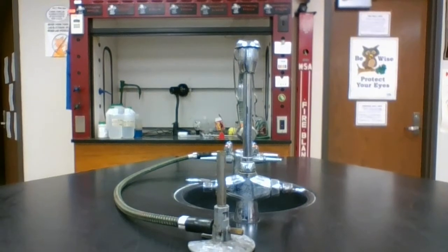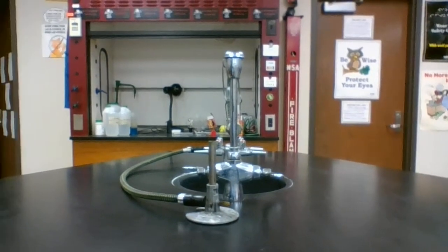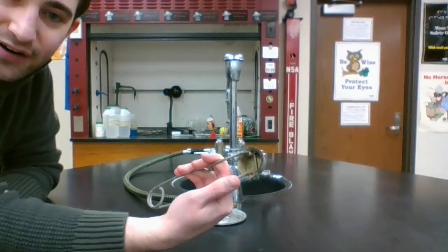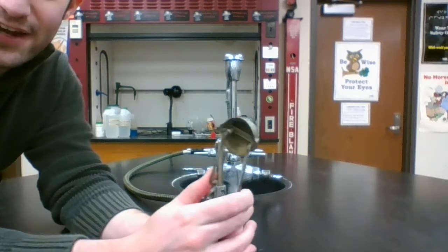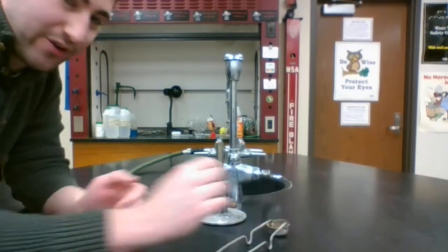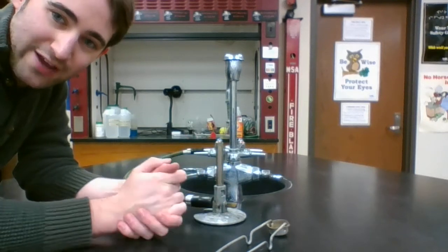Okay, so this is a Bunsen burner. We use it to burn gas, typically natural gas, so like methane is one of them, and also some propane. Okay, I've also got a striker here that makes sparks. Okay, it's not about how fast you go, it's about really pressing that against that plate there, getting the flint to strike. Okay, so I'm going to go turn on the gas. I'm going to light the Bunsen burner, and we'll see what this chemical change looks like in real life.